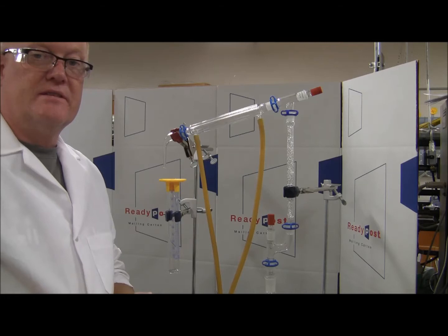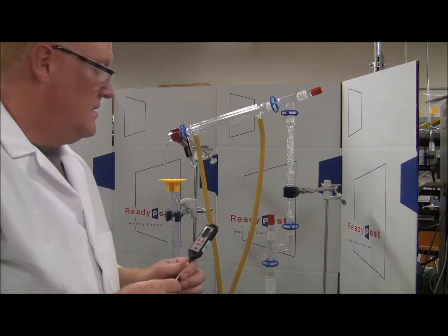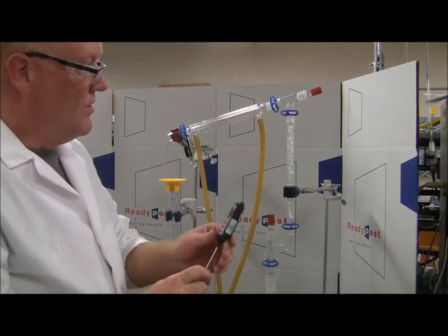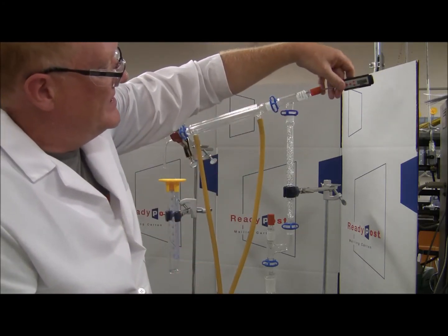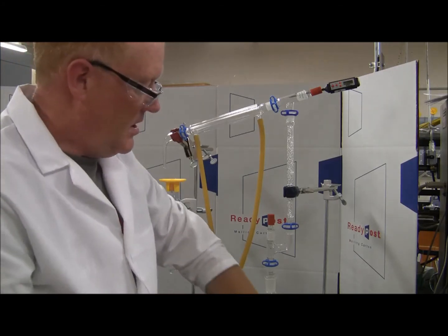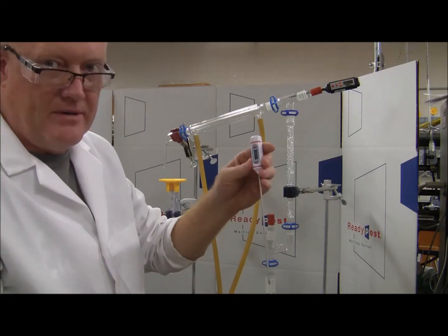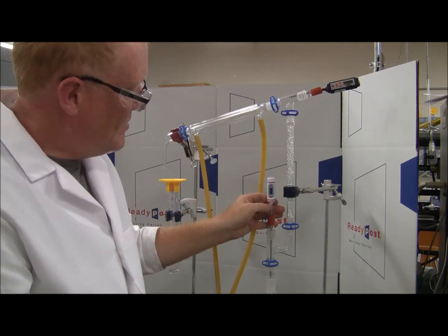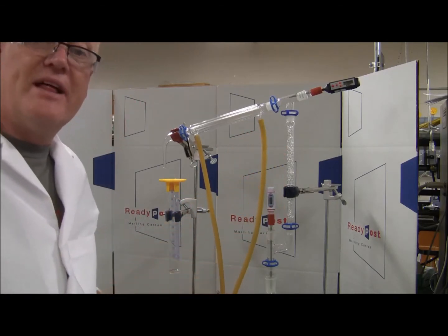The graduated cylinder is not included in the kit, but there are 2 thermometers included in the kit. The shorter one comes here, up at the top. That's going to measure the vapors at the top of the column. The longer thermometer goes in the bottom. It will measure the temperature in the flask.